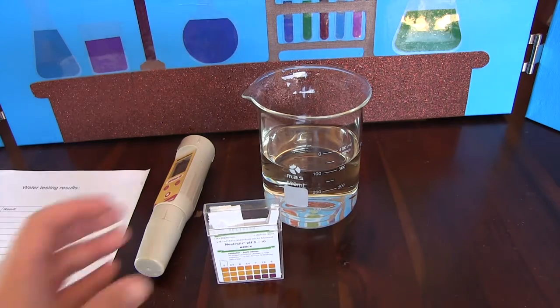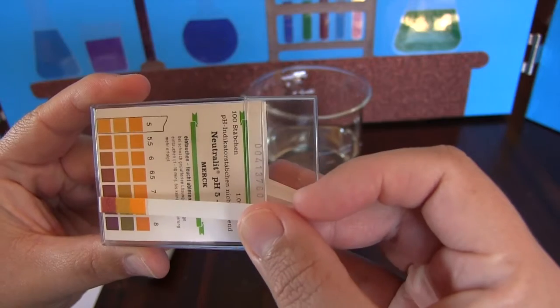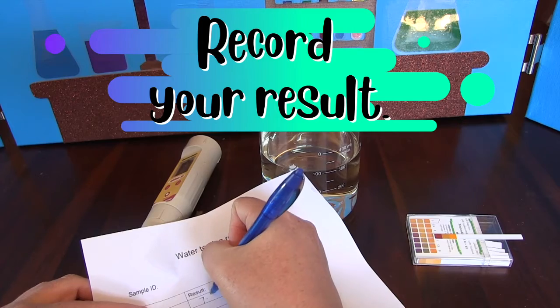Once the timer has finished, we grab our pH strip and hold it up to the case of the pH strips. We can see by measuring the colours that our pH is at roughly 7.5. We then record our result.